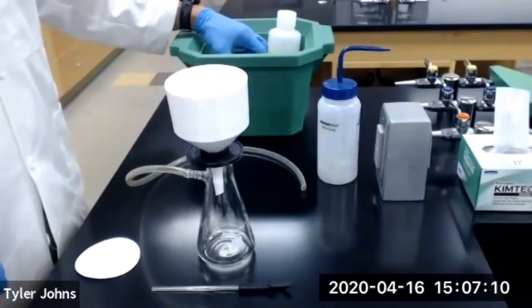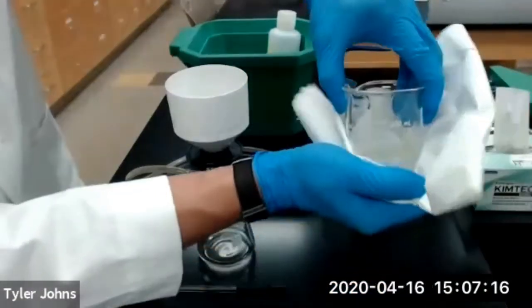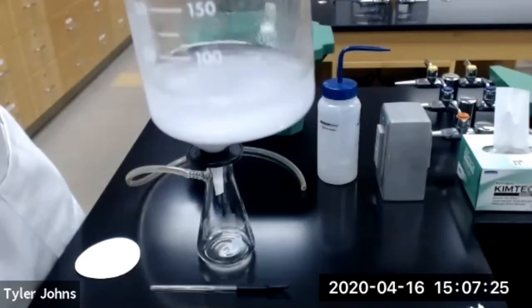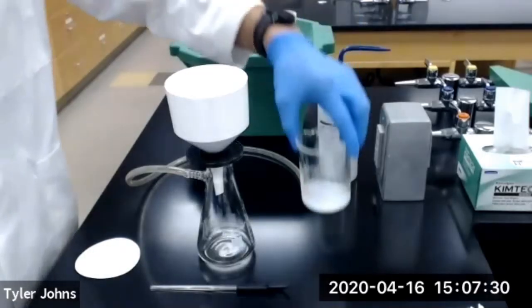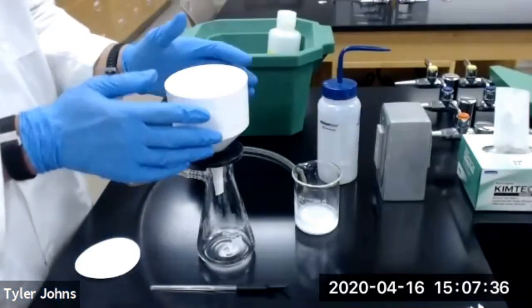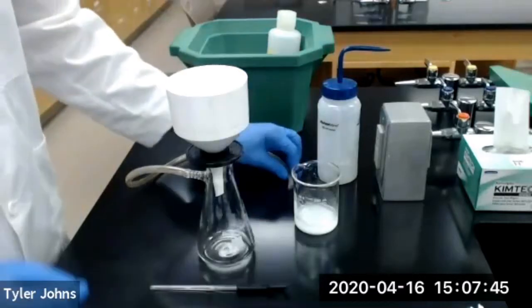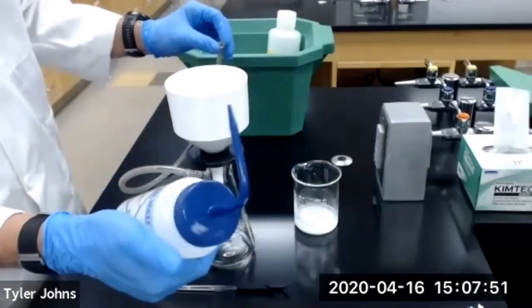Okay, so our alum has been on an ice bath for about 10 minutes, we've been stirring, and you can see crystallization has occurred. That white precipitate is our alum. So what we're going to do now is set up a Buchner funnel assembly. So we have our Buchner funnel, filter flask, some filter paper that we'll be placing in the Buchner funnel, and our vacuum line is not working, so we're going to be using an empty water bottle to pull a vacuum through the Buchner funnel.